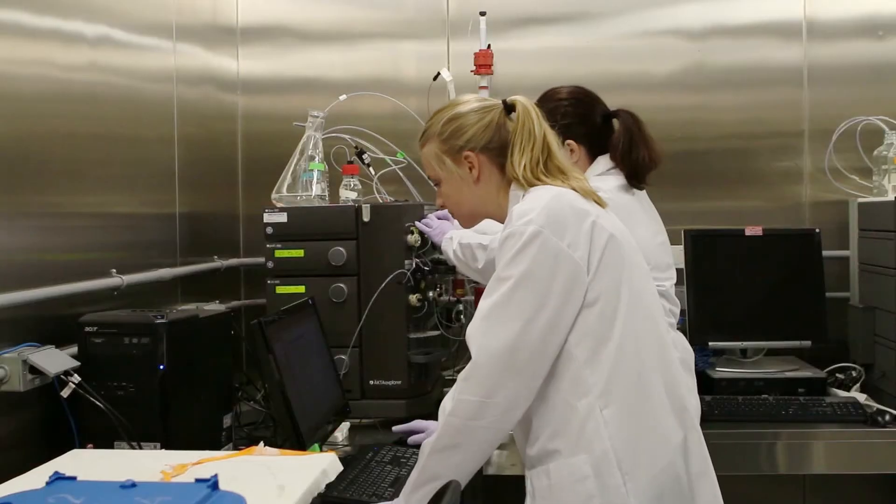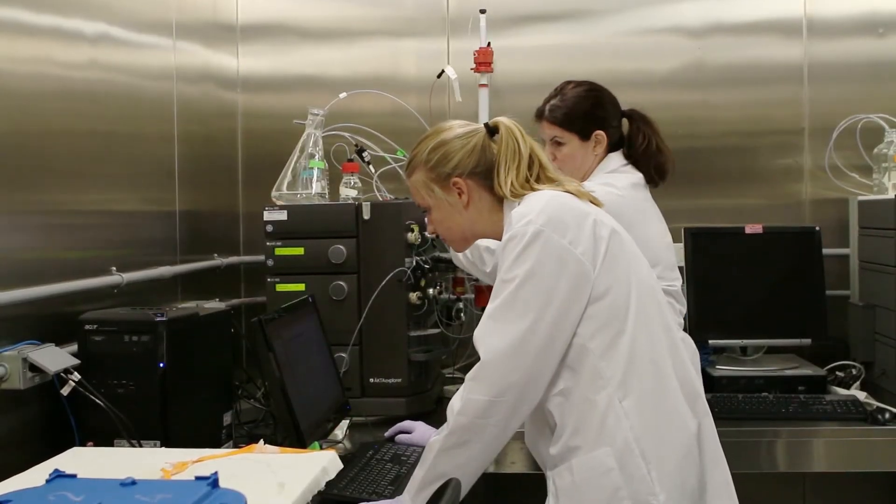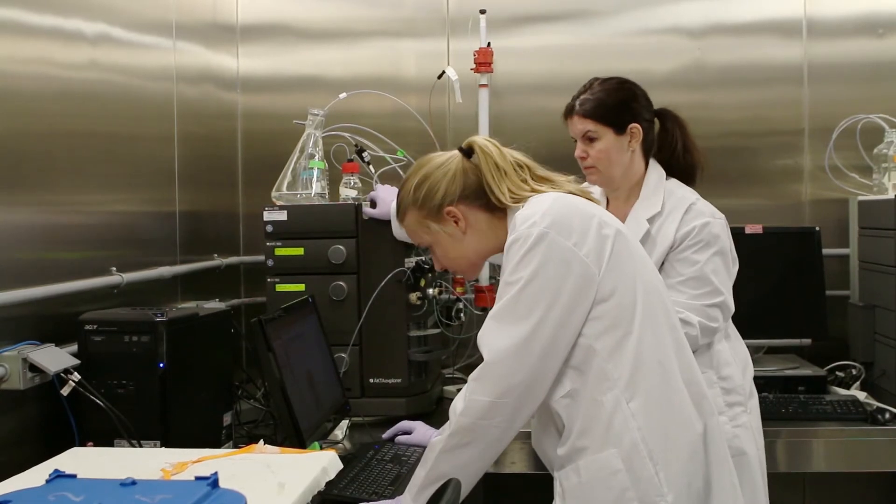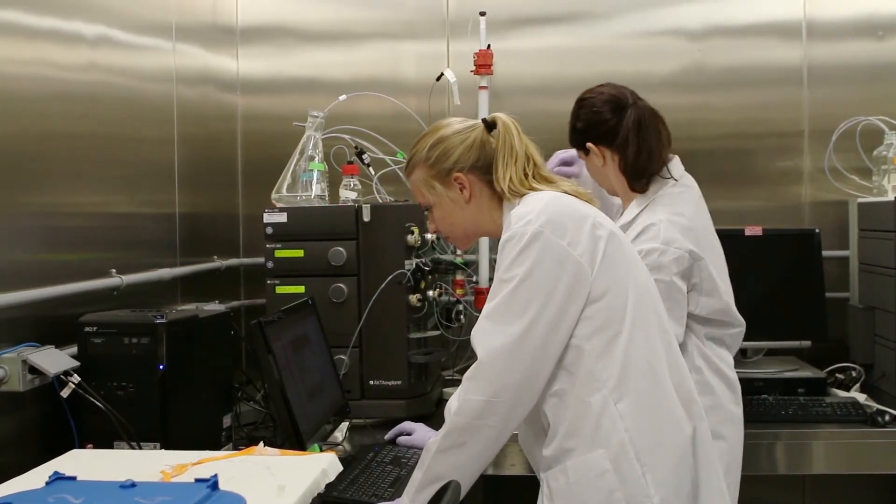We also have a protein and cell biology lab. This features biosafety level one and biosafety level two growth of microorganisms, where we also do eukaryotic and mammalian type cells.